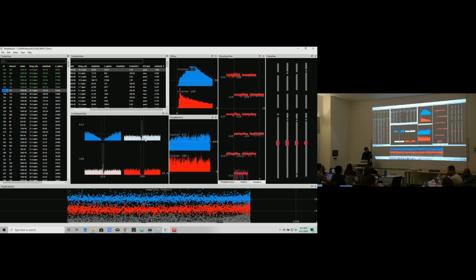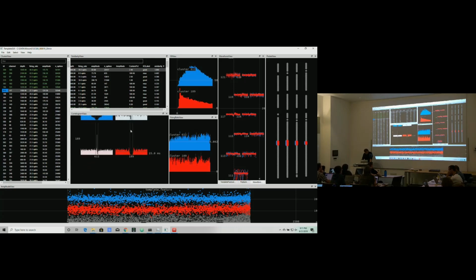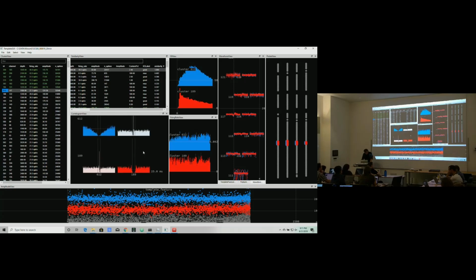Correlograms as well. I guess yes, you can see it in the correlogram. How do you see that in the blue and the red one? Oh right, those are different because blue has this rising shape, slowly rising, yeah, and the red is kind of more constant. Yeah. So I guess this is for those of you that know a little bit about Poisson statistics, right?